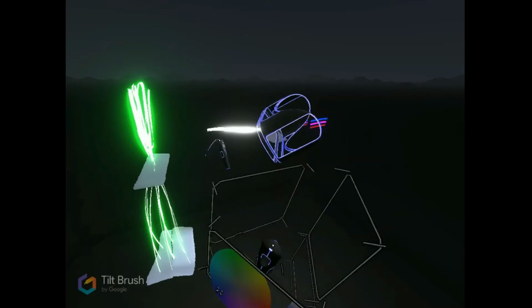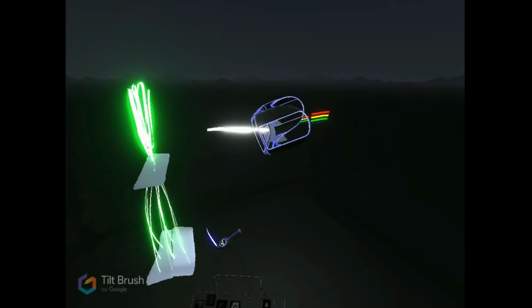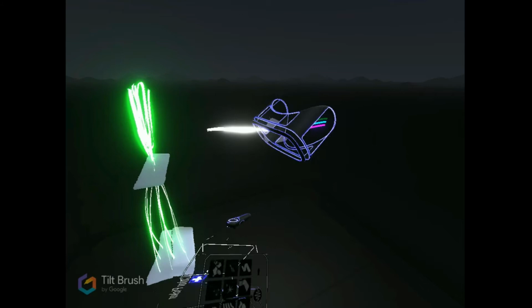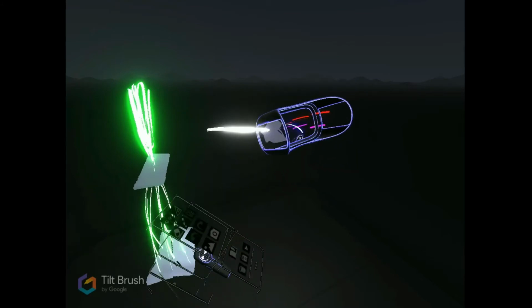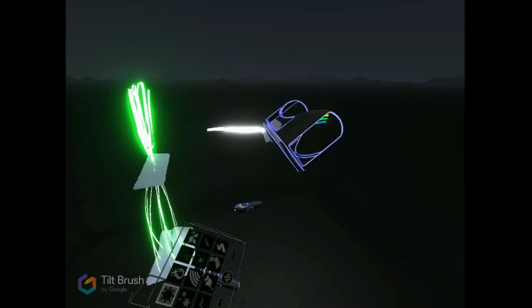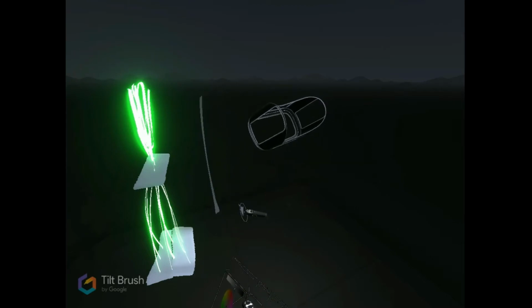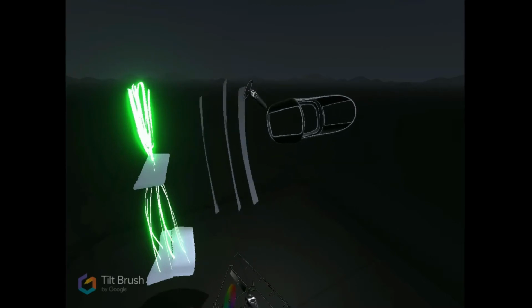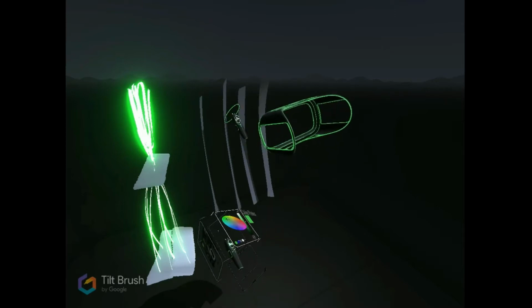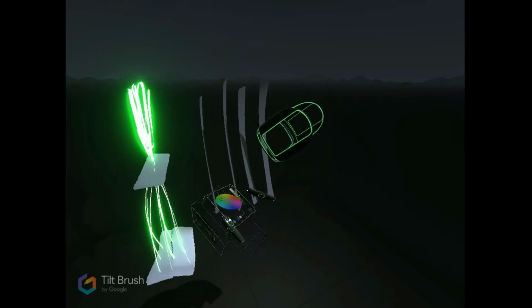So, yes, electron diffraction. Basically what's happening is you have your electron beam and it's splitting, much like a light that goes into a prism splits into a rainbow. Only this time it's not splitting because of different speeds of the colors of light, being different wavelengths and all. This time it's because, unlike the beams of light in a prism, with electron diffraction you have these planes of atoms because you have a crystalline material. In fact, it only works with crystalline materials.